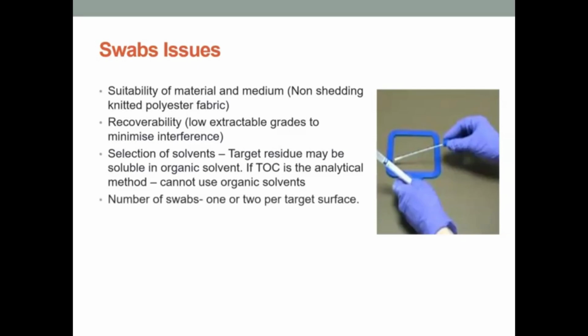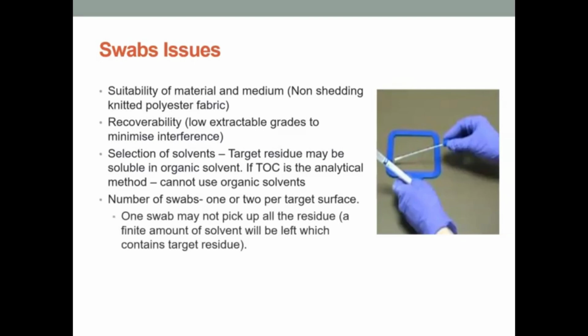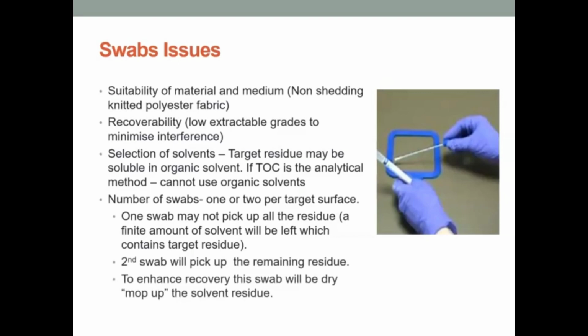The number of swabs: you may need one or two per target surface. One swab may not pick up all the residue. A finite amount of solvent will be left, which contains the target residue. A second swab may then be needed to pick that remaining residue up. To enhance recovery, the second swab will generally be dry, to mop up the solvent residue.